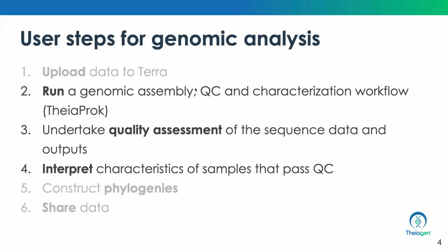Ideally, thinking about the steps for genomic analysis, you've uploaded data onto your Terra workspace, and now the next stage is to undertake these 3 things. We run TheiaProk, we get an assembly, we do some QC, as well as characterize the data. At the end, we should be able to interpret the characteristics of the samples that pass QC.